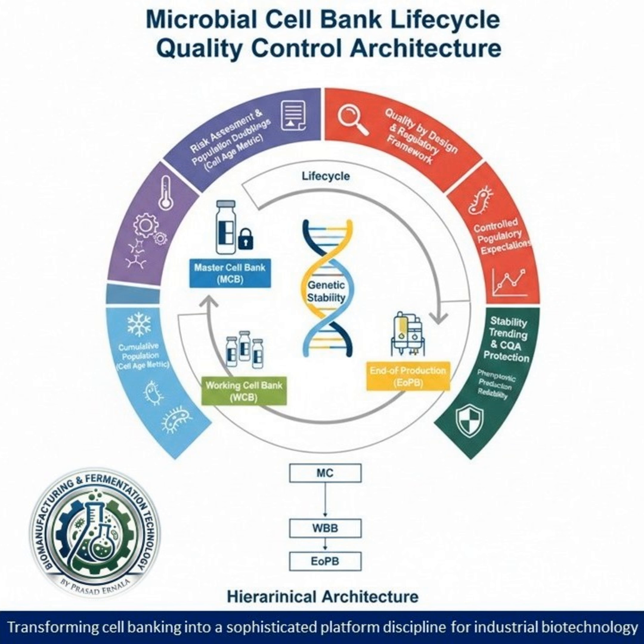And you can only know that if you've tested it. You have to do excursion simulation studies. You intentionally warm some vials up to, say, minus 40 degrees for a set time, and then you immediately retest all the CQAs to prove they're still good. So a company has to proactively simulate a failure just to prove the vials can survive a power outage? That's right. This is what elevates it from simple storage to proactive risk mitigation. You can't just hope the bank survives. You have to have data proving functionality is maintained, otherwise you discard every single exposed vial. And that is immensely costly.